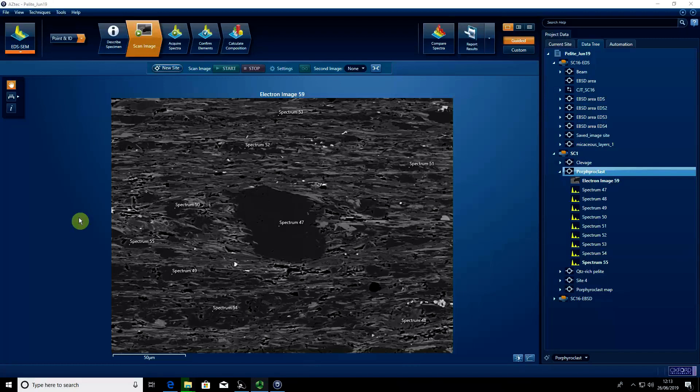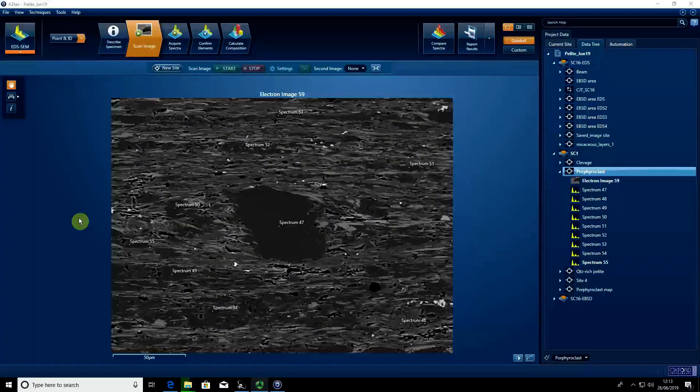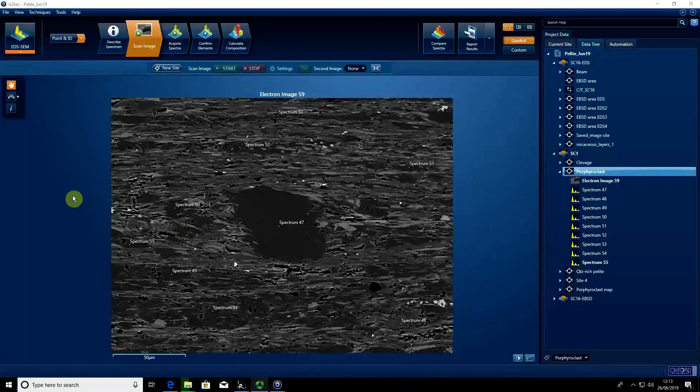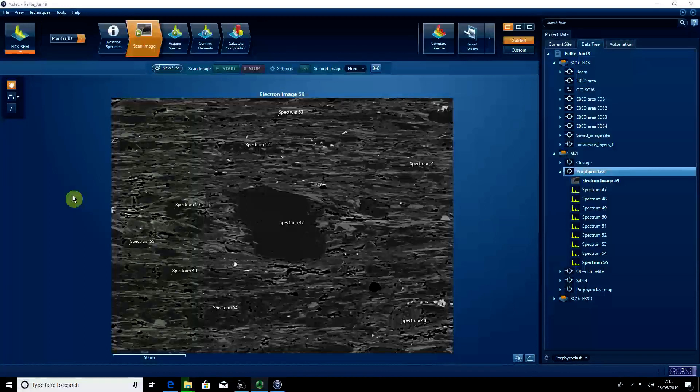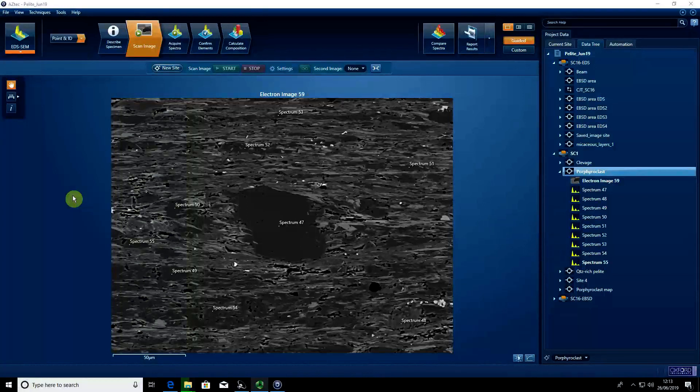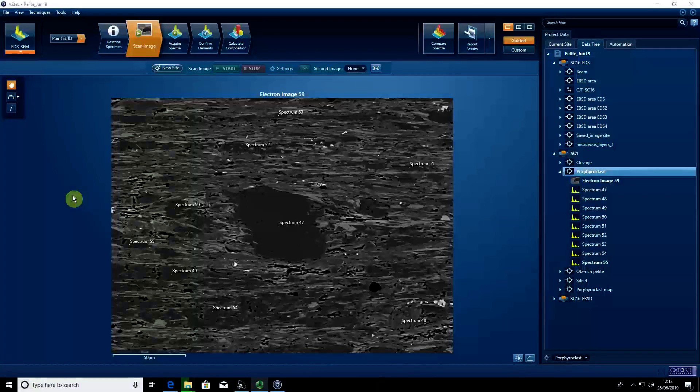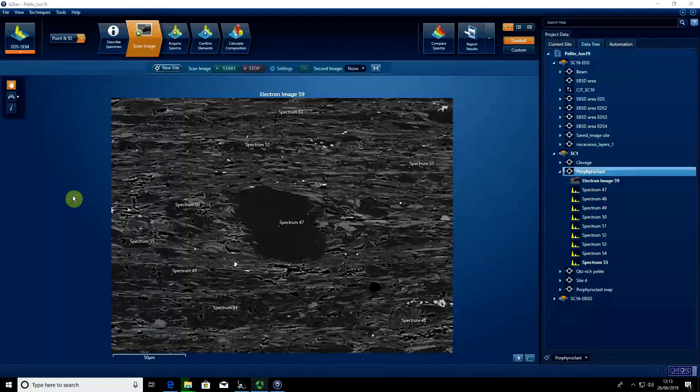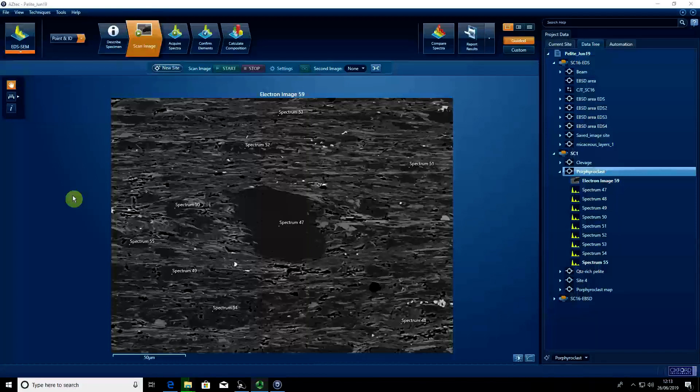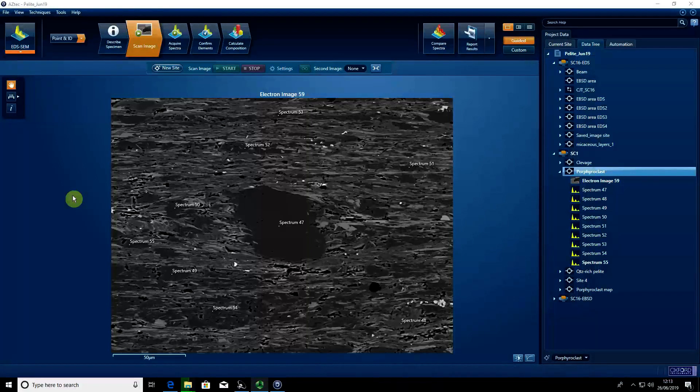Having acquired our spectral data and images, it's now time to export all that information so we can investigate our data away from the computer.